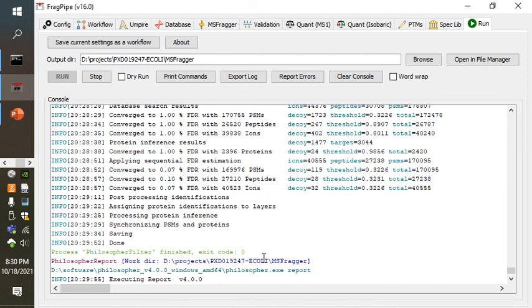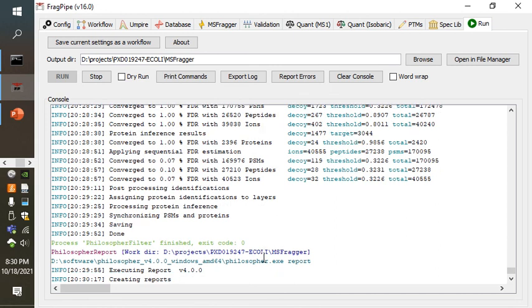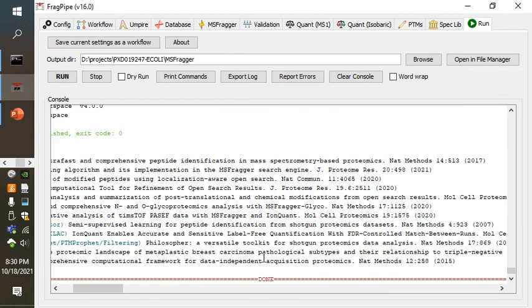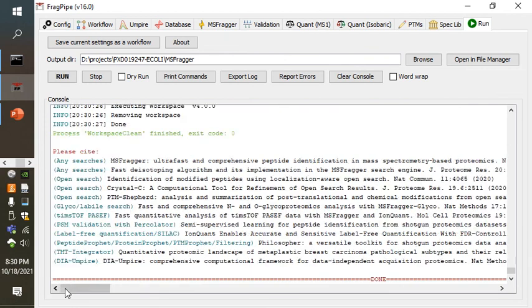Imagine that you had a protein that was highly hydrophobic throughout its length. The number of lysines and arginines within that protein sequence would be really problematic for trypsin digestion. As a result, it would be very unlikely that you would have peptides identified for it in a tryptic search, because trypsin had nothing to do. There were no cutting sites for it to cut. As a result, something like that would be missed.